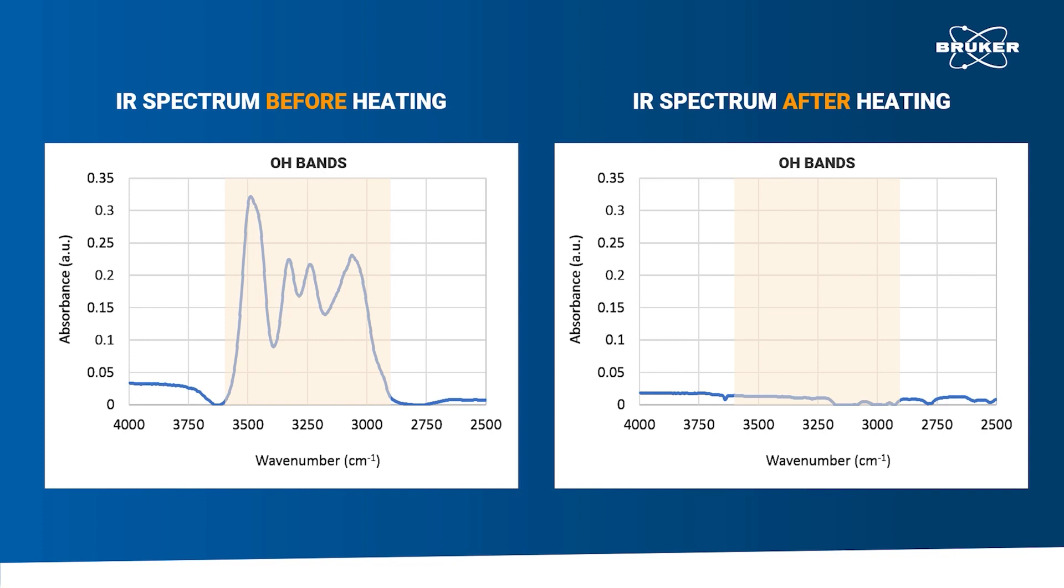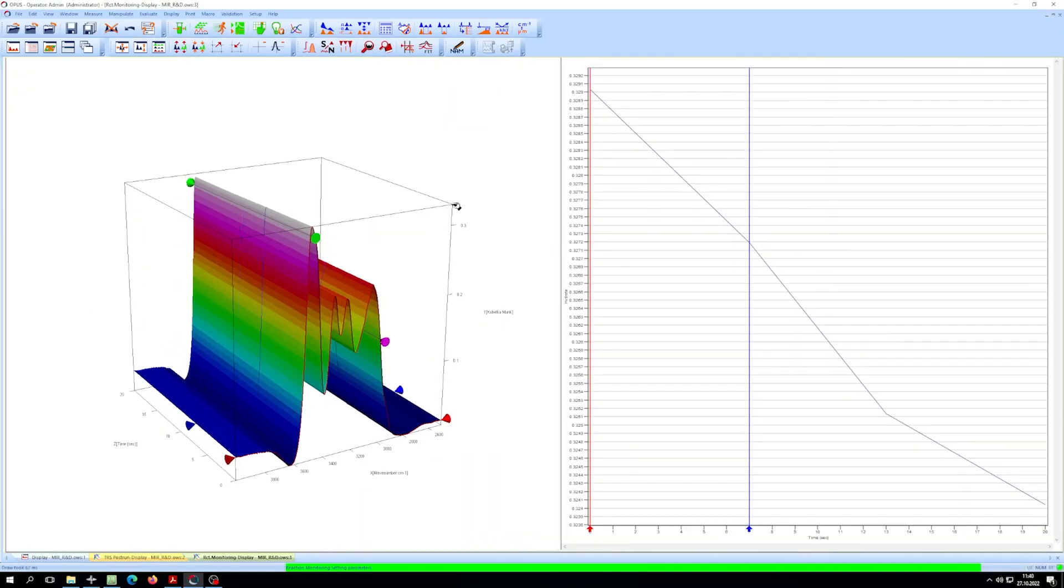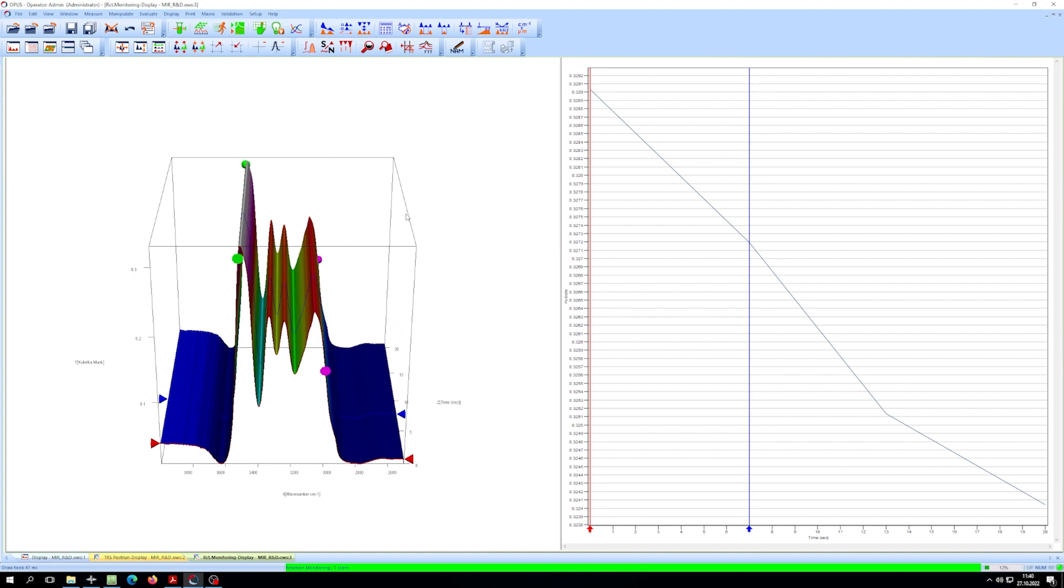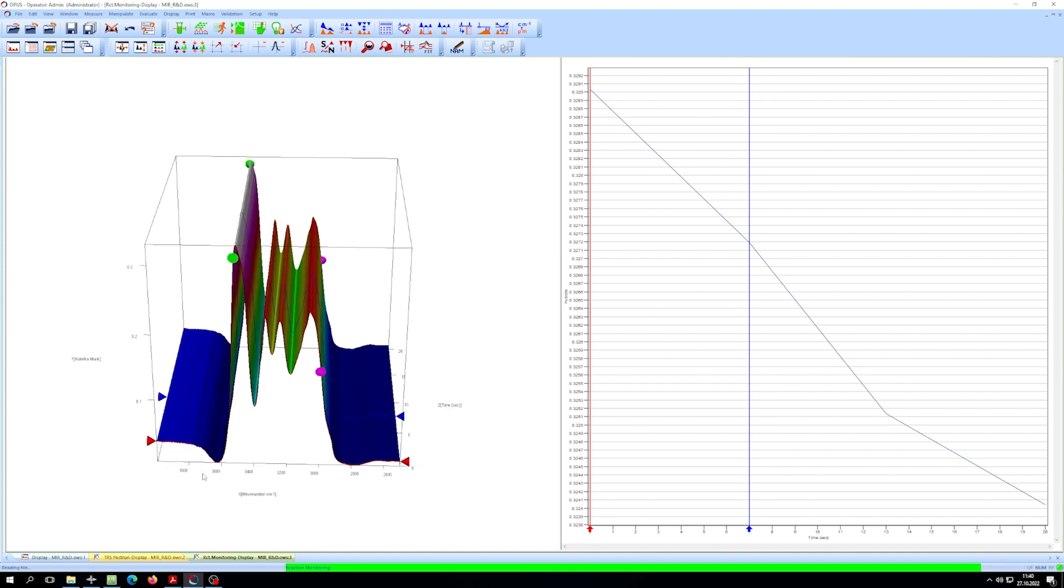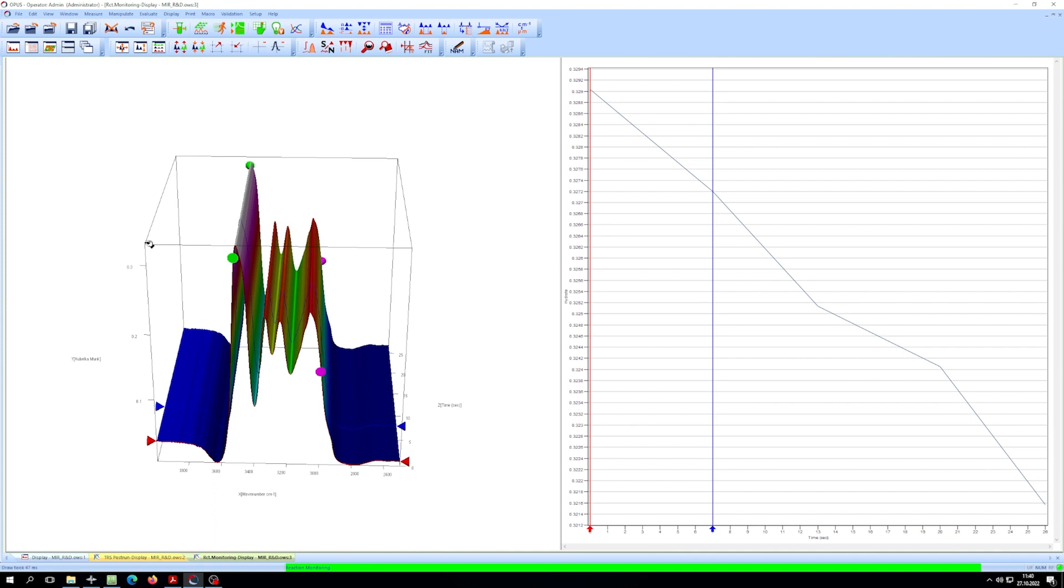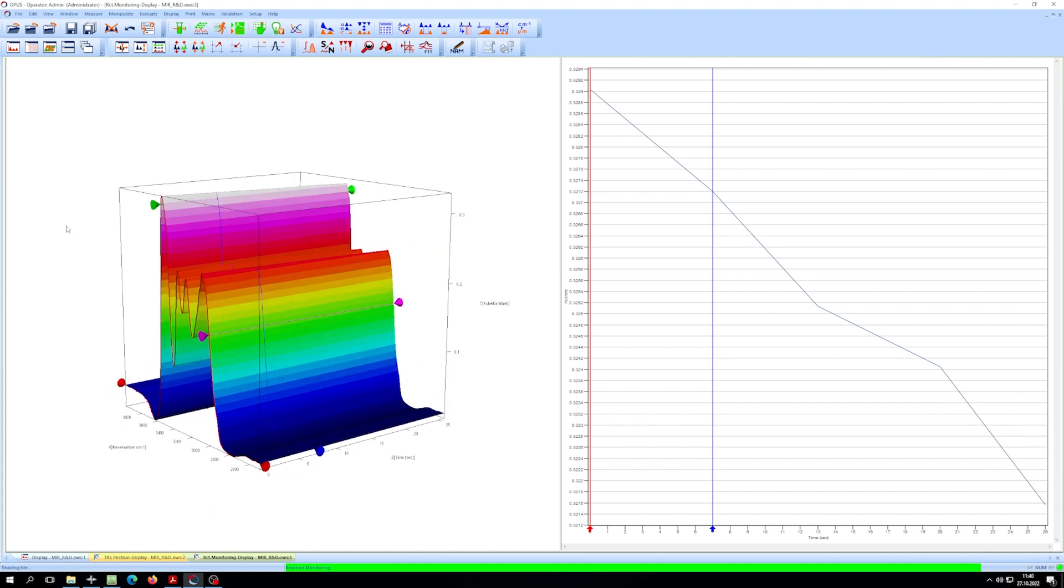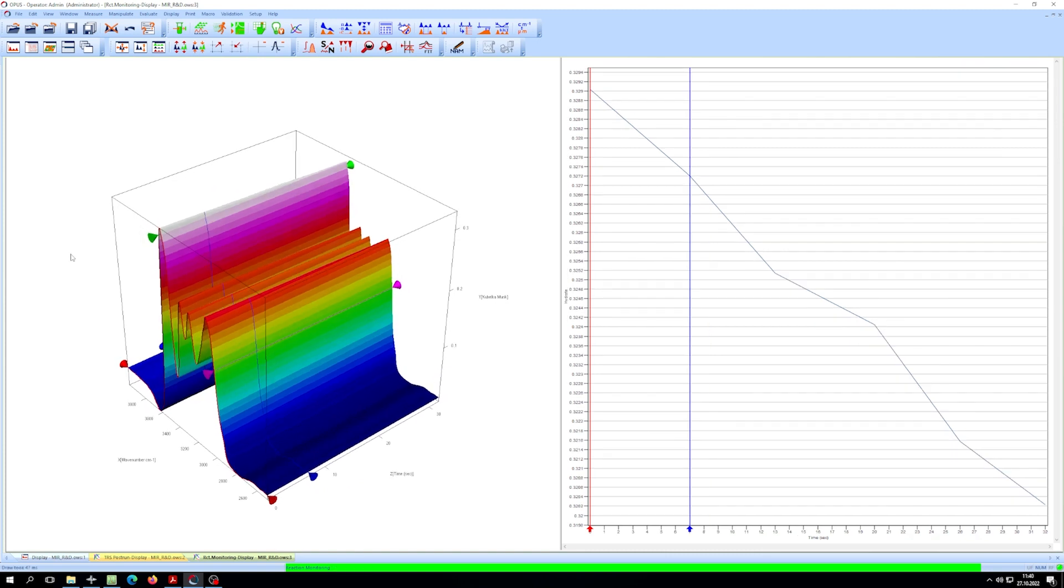So, let's take a closer look and watch the sample lose its water. What you see in this 3D plot is exactly the absorption bands region of crystalline water. The third axis is the time axis. As you can see, new data is constantly added to the 3D plot. The curve on the right shows the change of the total band intensity over time or, in our case, during the warming.